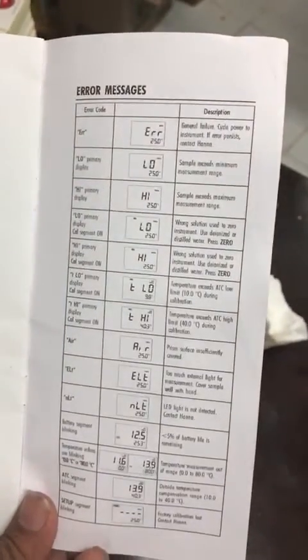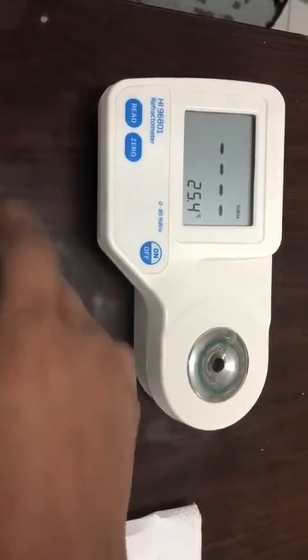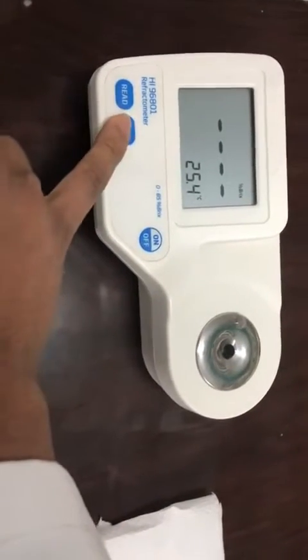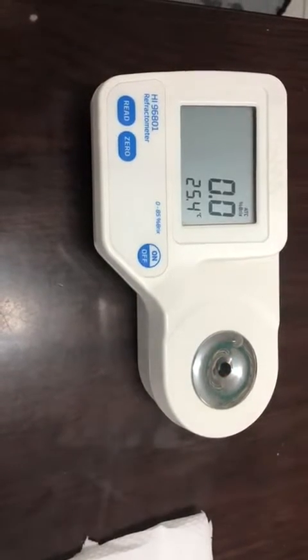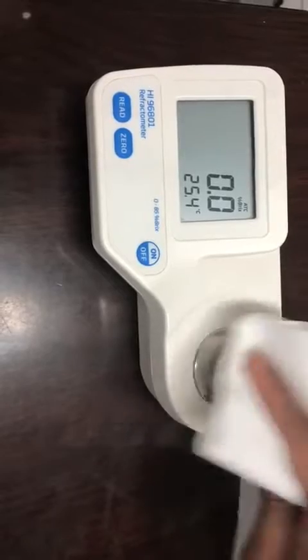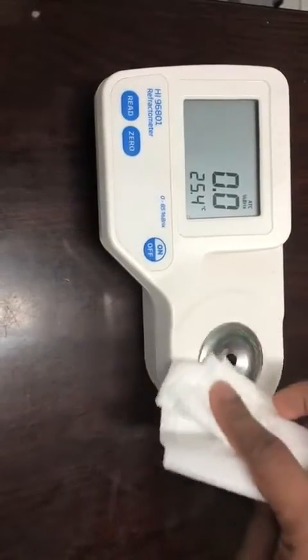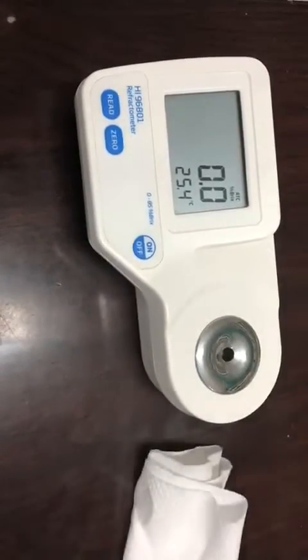First, to calibrate the value, add a small drop of sterile water and then press 0 for calibration. You'll notice it is calibrated, and then wipe it off. Please note that the finest temperature for working is 25 degrees Celsius or below, which is displayed on this screen.